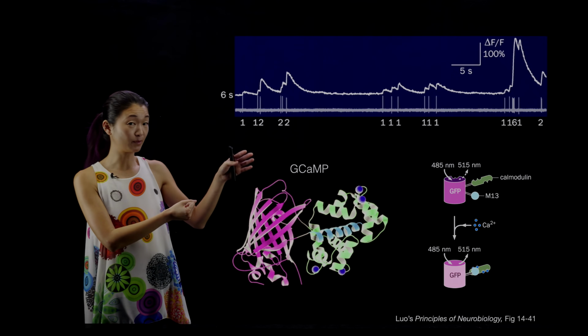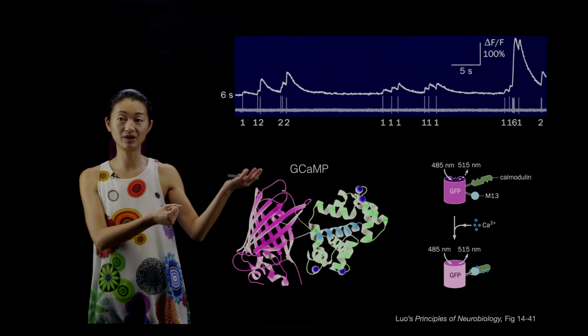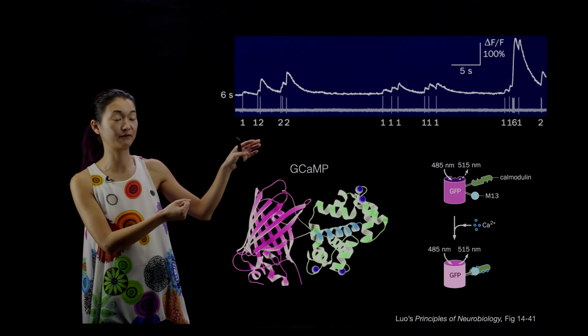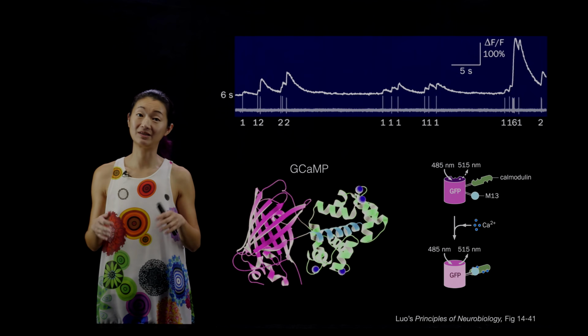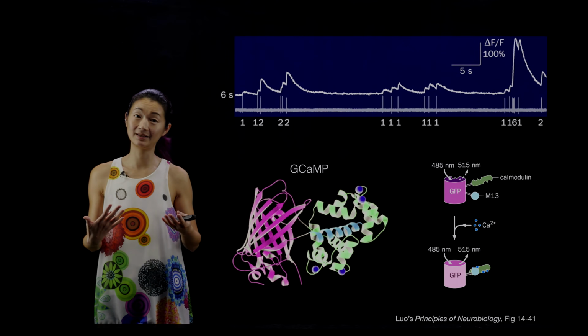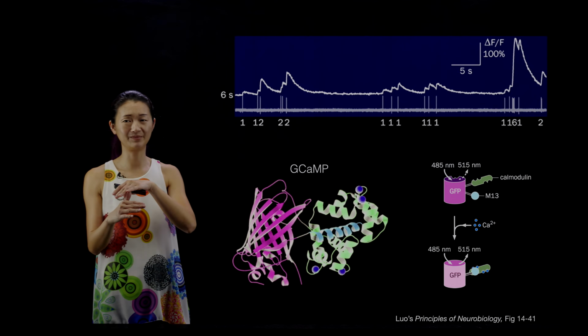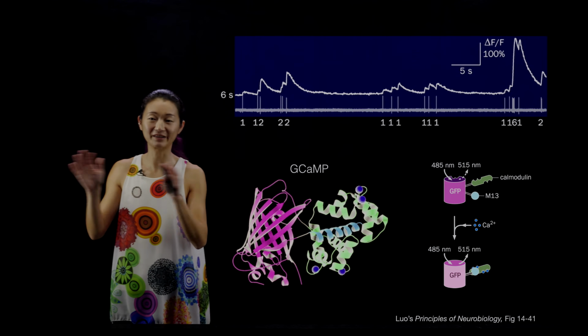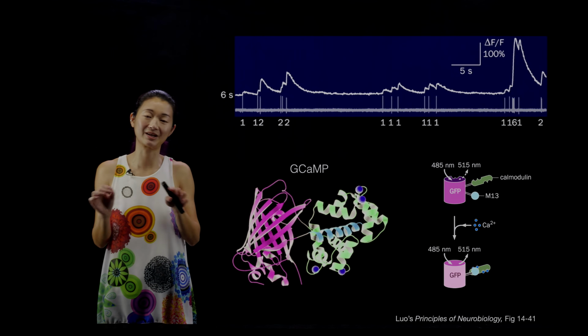But that's actually not proportional to the electrical activity. What people usually do is turn that into what's called a delta F over F. We're looking at the change in fluorescence in a given unit of time. This is the derivative of fluorescence. And then we normalize that by fluorescence in the previous time step. The details are, there's a lot of different ways to do it. So I'm skipping over the details because it's not totally well established exactly how to do this.